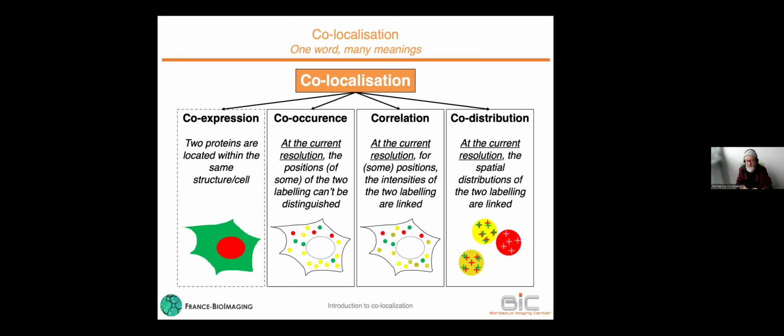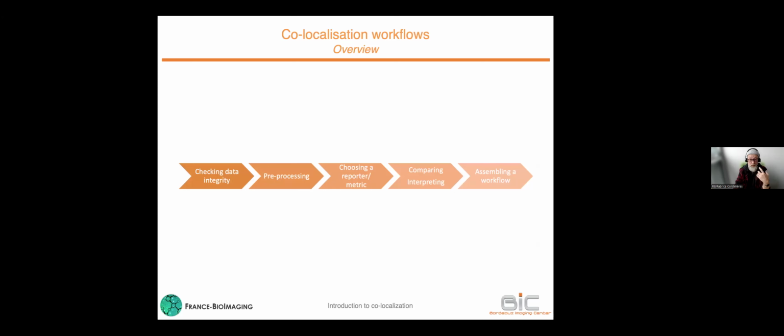So you see colocalization, one word, and at least four meanings. This is why when starting a colocalization study, you must have in mind what you're expecting, at which resolution or at which level you're working. Then let's talk about the workflows.